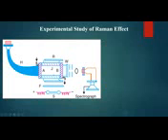And a semicircular aluminum arc is used here. This R represents a semicircular arc, which has the reflecting property. Aluminum is used, which is a good reflector of light. So multiple reflection of incident light takes place here, which means more illumination of the liquid. More and more photons will fall on this particular liquid because of the reflection from this semicircular arc.